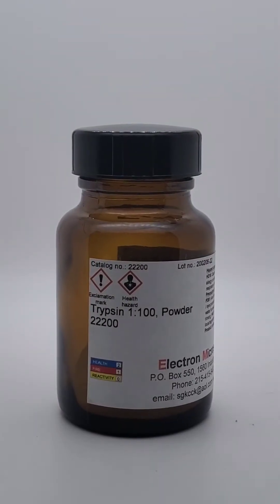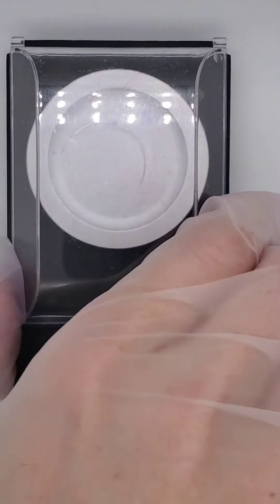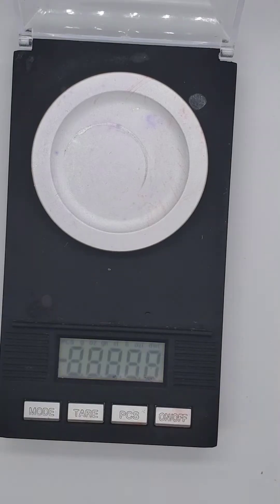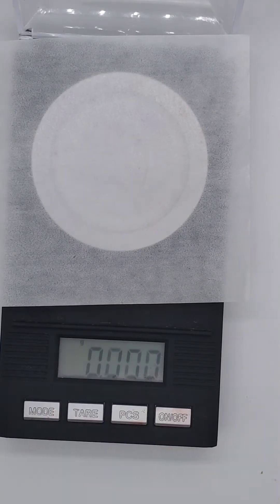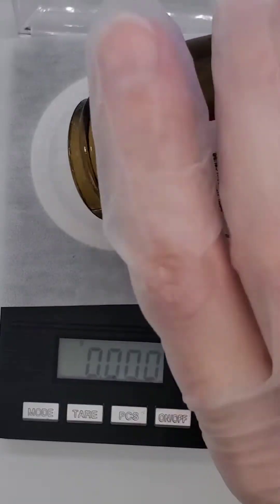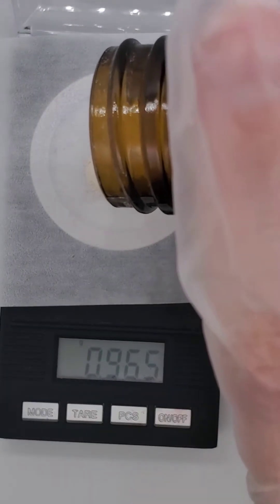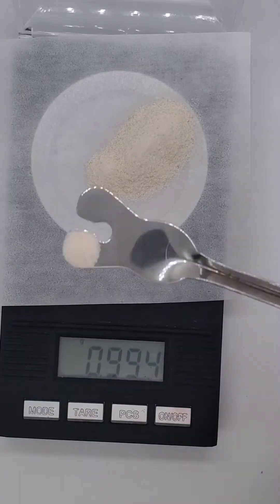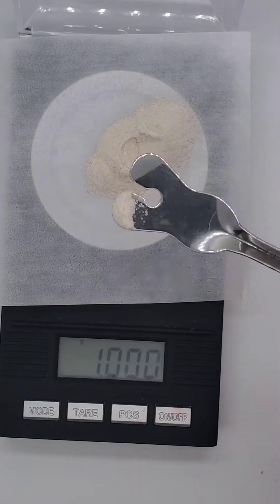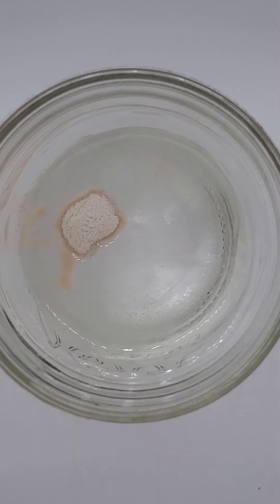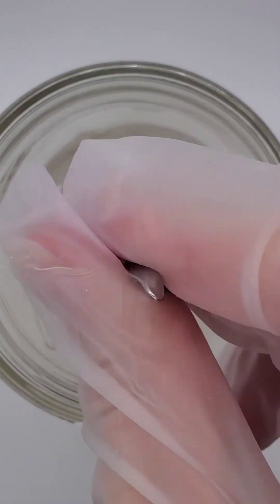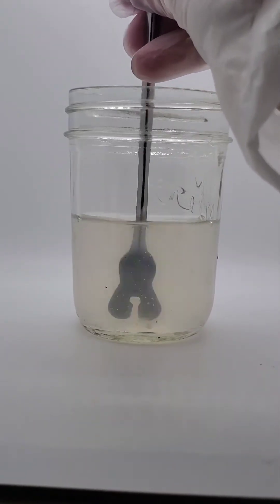And then you're gonna need one gram of trypsin powder. So let's measure that out. Okay, let's add that to the sodium borate and distilled water. Make sure to stir it up. I don't want it to be all clumpy.